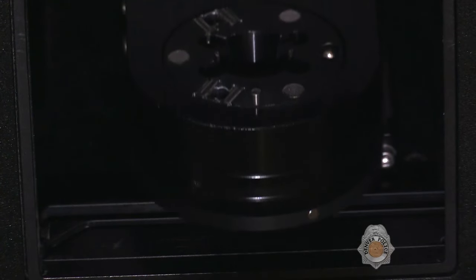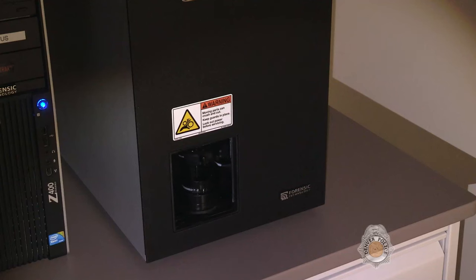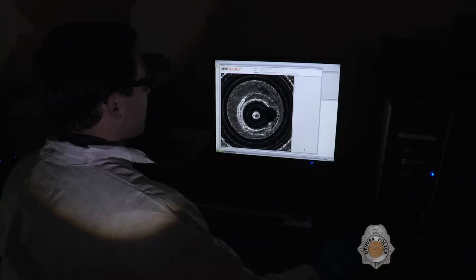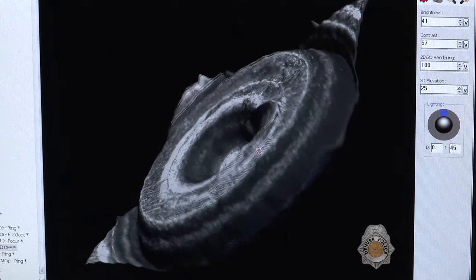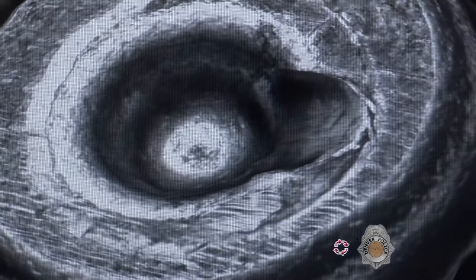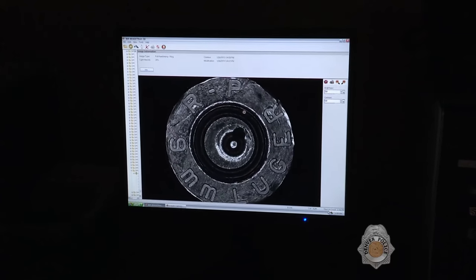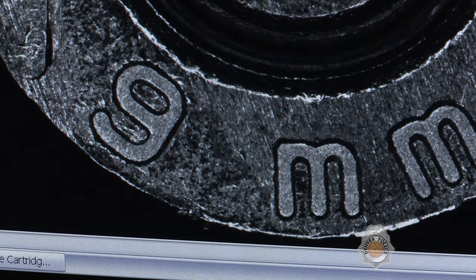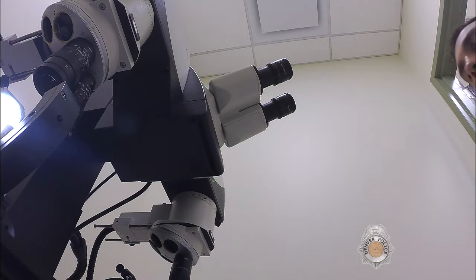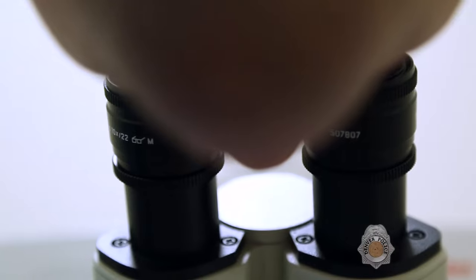The Firearms and Toolmark Unit also utilizes the National Integrated Ballistic Information Network, or NIBIN, database entries and examinations. NIBIN captures digital images and 3D renderings of unique marks on fired cartridge cases recovered from crime scenes or test fired on our forensic firearms range. It compares these images to others in the NIBIN database to see if they match any previous shooting incidents. Any potential associations found using the database are confirmed via traditional microscopic comparisons.